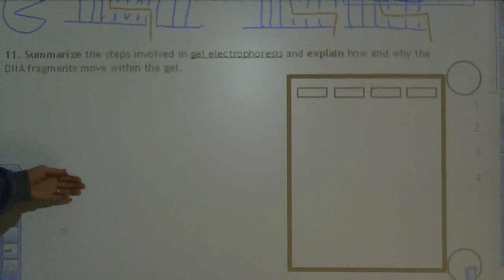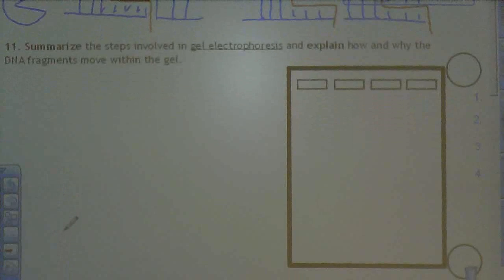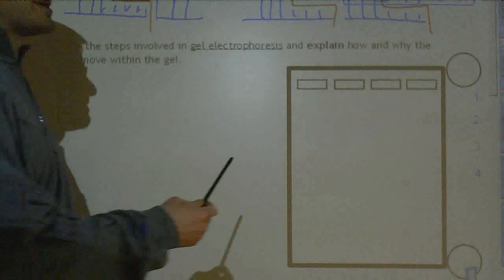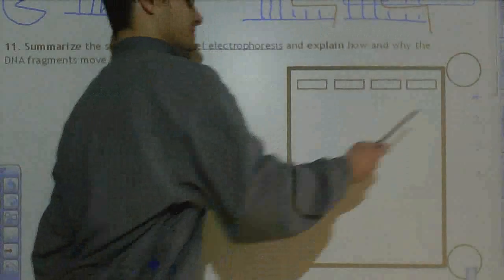All right, so moving on to objective 11, summarizing the steps in gel electrophoresis, and explain how and why the DNA fragments move within the gel. So let's get started. I'm going to pull them up, kind of magic of technology method.